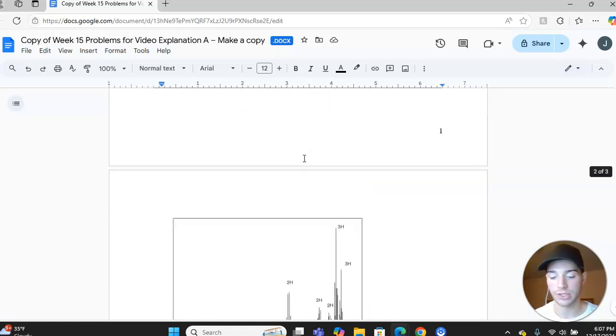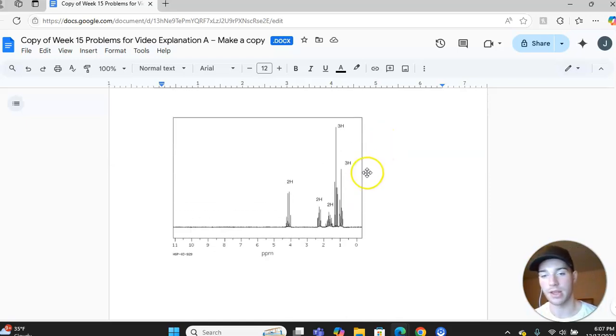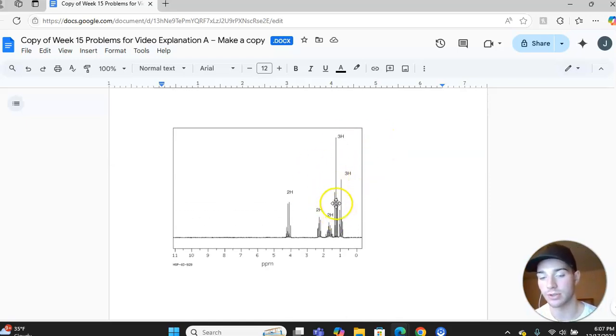So now I just had the ester group drawn on my paper, and the hydrogen NMR spectrum actually let me finish the molecule. The first thing I looked at within this hydrogen NMR spectrum was the peak at about 4.1, 4.2.